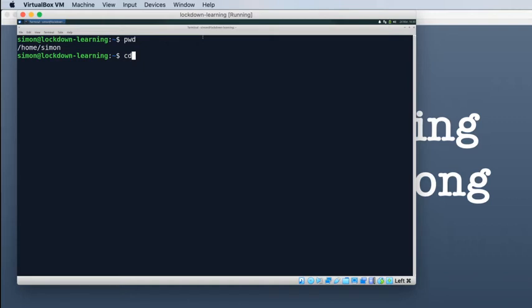Our first command was pwd for print working directory, and our second command is cd, which stands for change directory. pwd just reports where you currently are in the file system. cd allows you to move around the file system. Again, you will do this by writing out a path, a place on the file system where you want your prompt to go, where you want your terminal to go. In this case, I'm going to cd to the root of the file system. And if you remember from what I've said already this afternoon, the root of the file system is denoted by a single / character.